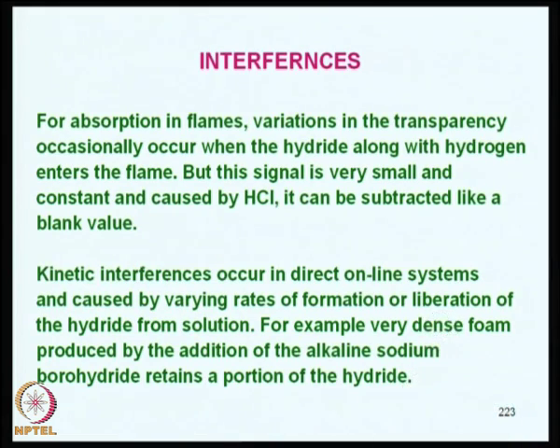will be a high speed reaction producing a lot of hydrogen all the time, and then there will be foam, and this foam itself will retain part of the metal hydride instead of letting it out of the system into the flame. So, such a possibility exists whenever you are using sodium borohydride. So, very dense foam is not desirable in the atomic absorption system, where you have to do online analysis.